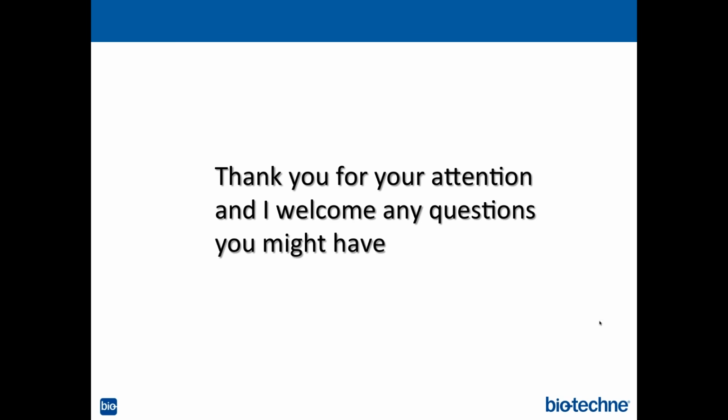I was just wondering what expression system you use for your recombinant antibodies. Are you asking about the cell line itself? Yes. Okay, we're using a HEK293 system, and I probably should have pointed that out on the FABs. I actually had it on the title. We're using our HEK system for everything that I've shown today. We're not using a CHO system. Okay, thank you. You're welcome.